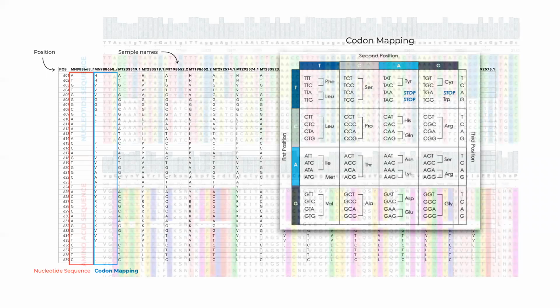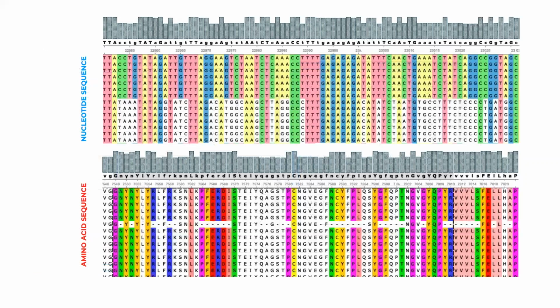So we will now do a similar analysis, but in much greater detail. We'll take the nucleotide sequence, we'll convert it to an amino acid sequence alignment, and as a result, we'll be able to incorporate some evolutionary analysis into the phylogenetic tree to understand evolutionary distance, okay? So let's do that together. This is what we'll do.